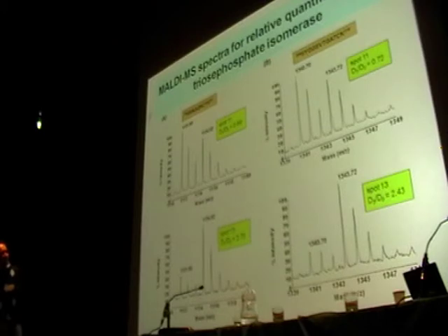That's a quick example just to prove that yes, we do quantification for specific proteins. That's the name of this protein. Quantification was done based on 2 different peptides, just to show that it's more valid. We got, obviously, for the full-size protein some decrease in this ratio, and obviously an increase for some fragments.